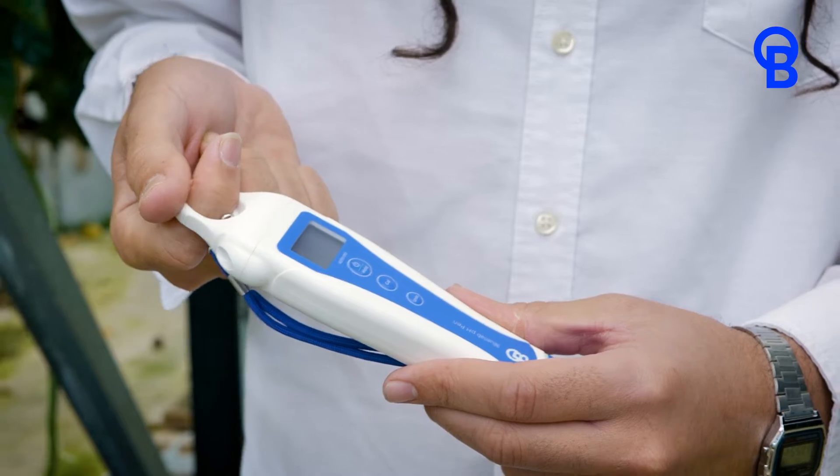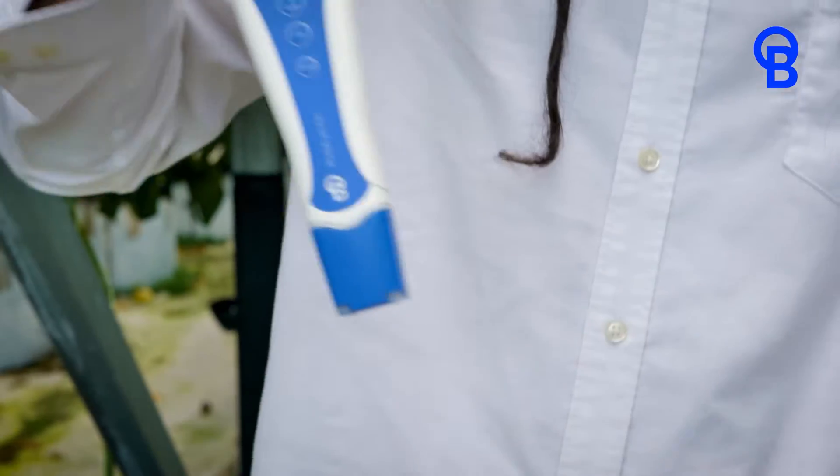The PH Pen has a few different design features. First of all is this loop at the top of the pen — a nice and stable way to hold the pen so you don't drop it. Also a good way to store it up on the wall if you've got some sort of nail or something on the wall. Hook it up.